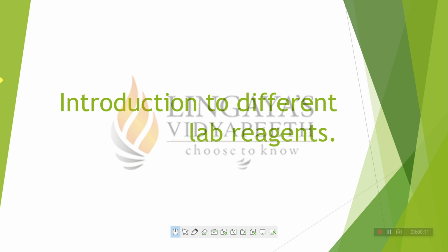In today's session, we are going to discuss the different types of reagents and chemicals that are used in the laboratories, how they are stored, and what the use of these reagents is in the laboratories. We will also discuss how we should preserve these reagents in the laboratory so as to increase their shelf life. So without delaying, let's start today's session.